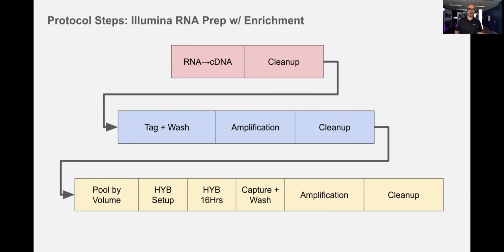We had that running on the Flex using a 96 channel. Our approach for this was to use a 384 well plate to hold the reagents, both the room temperature stuff and the stuff at 4 degrees. So using the 96 head for this was a simple, almost plate stamping, and just a direct transfer of 96 samples from the reagent plate to the sample plate.